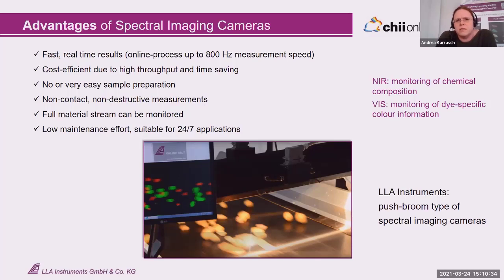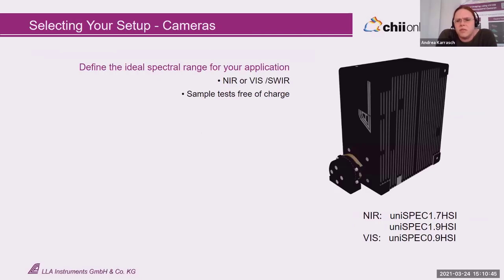LLA Instruments provides push broom type of hyperspectral imaging cameras. There are several types available on the market generally. If you now need to select your setup, if you plan to use hyperspectral imaging cameras within your food application, either in sorting or in monitoring in a plant supervision, you will at first need to define the ideal spectral range for your application.